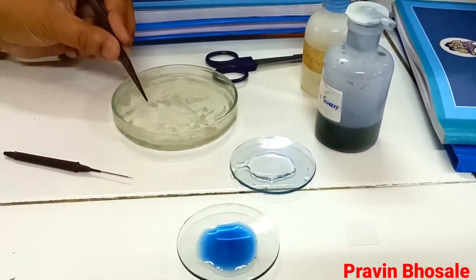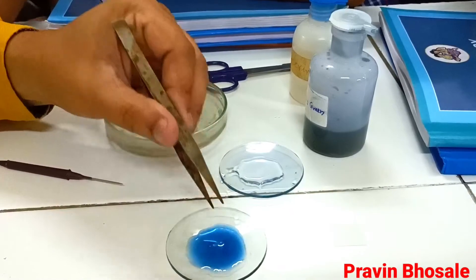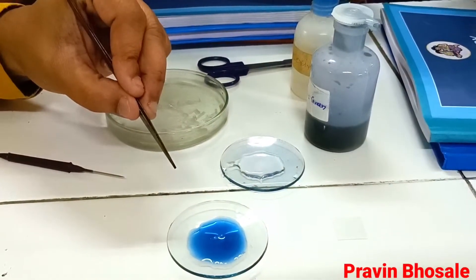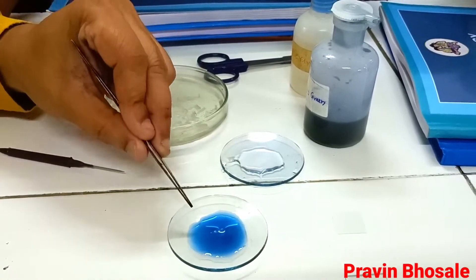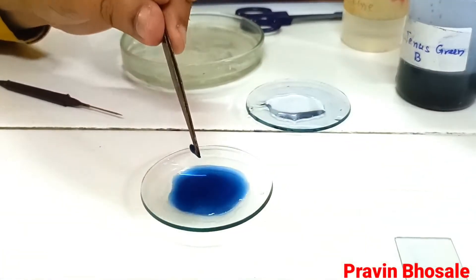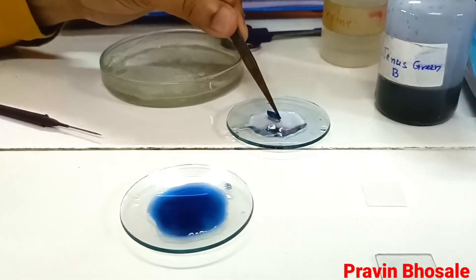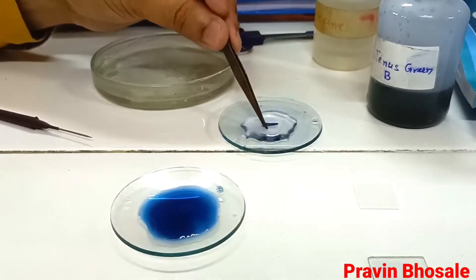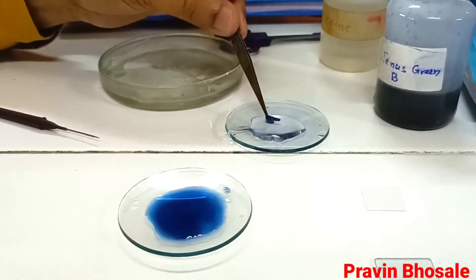Now first of all, take the onion peel on a watch glass containing Janus Green B — it is a staining medium. Keep it for five to ten minutes so that the mitochondria will take the stain. After ten minutes, take the onion peel and do the washings. Washings are required to remove the excess stain. Take the onion peels on a watch glass containing water and do the washings so excess stain will be removed.